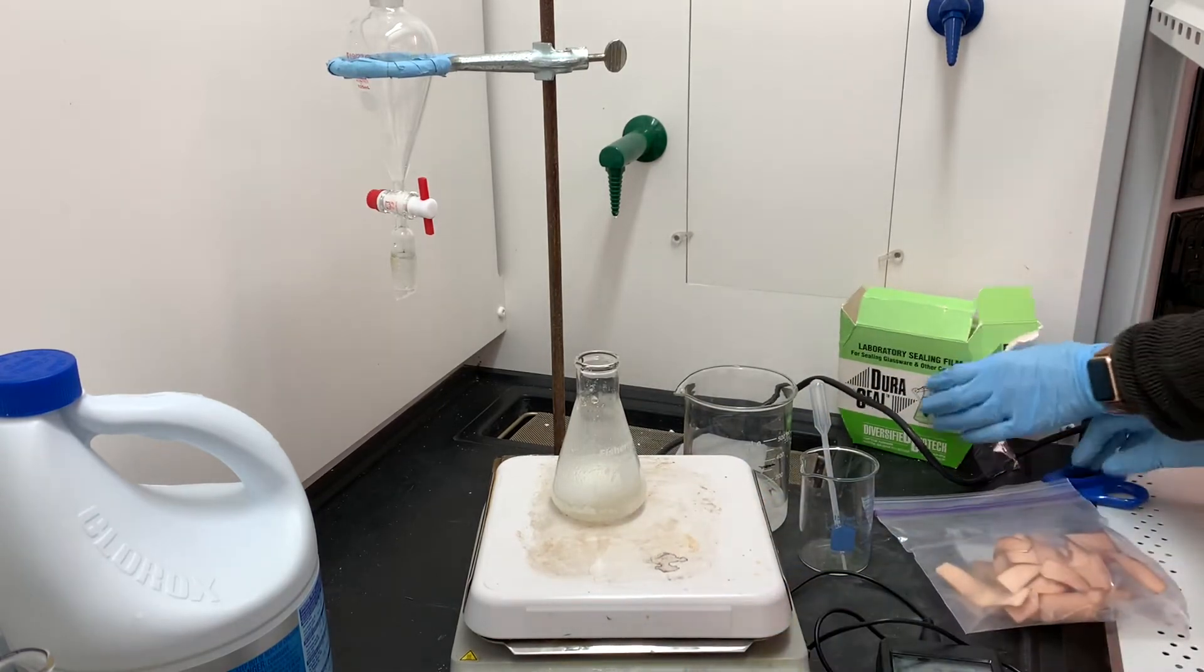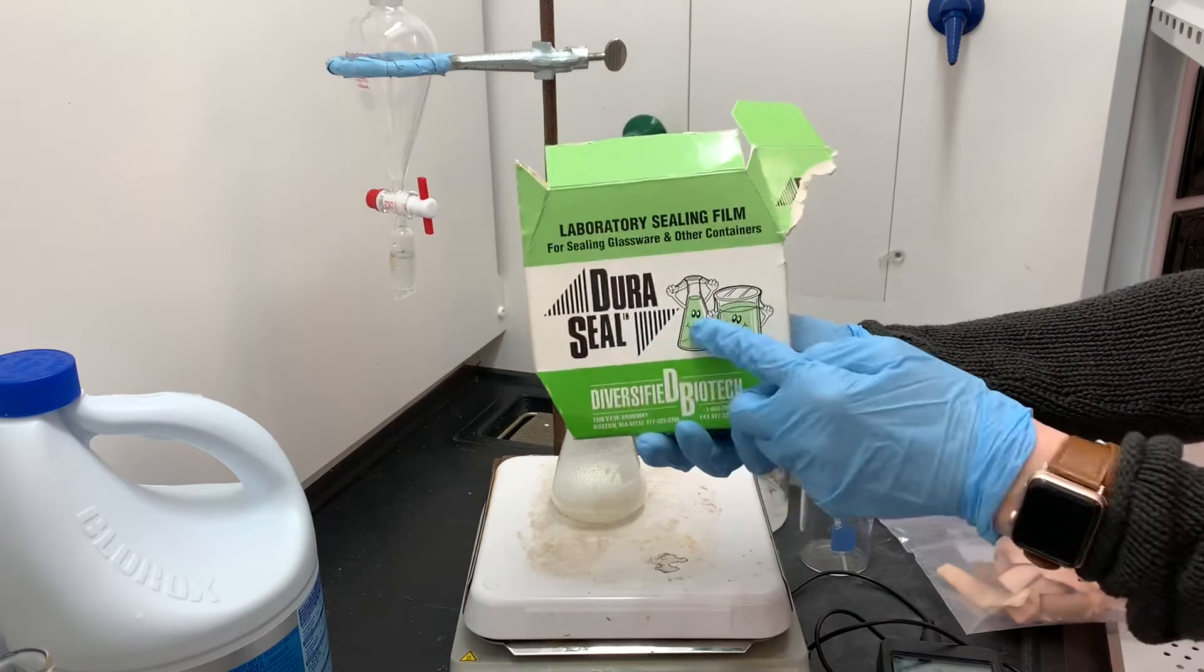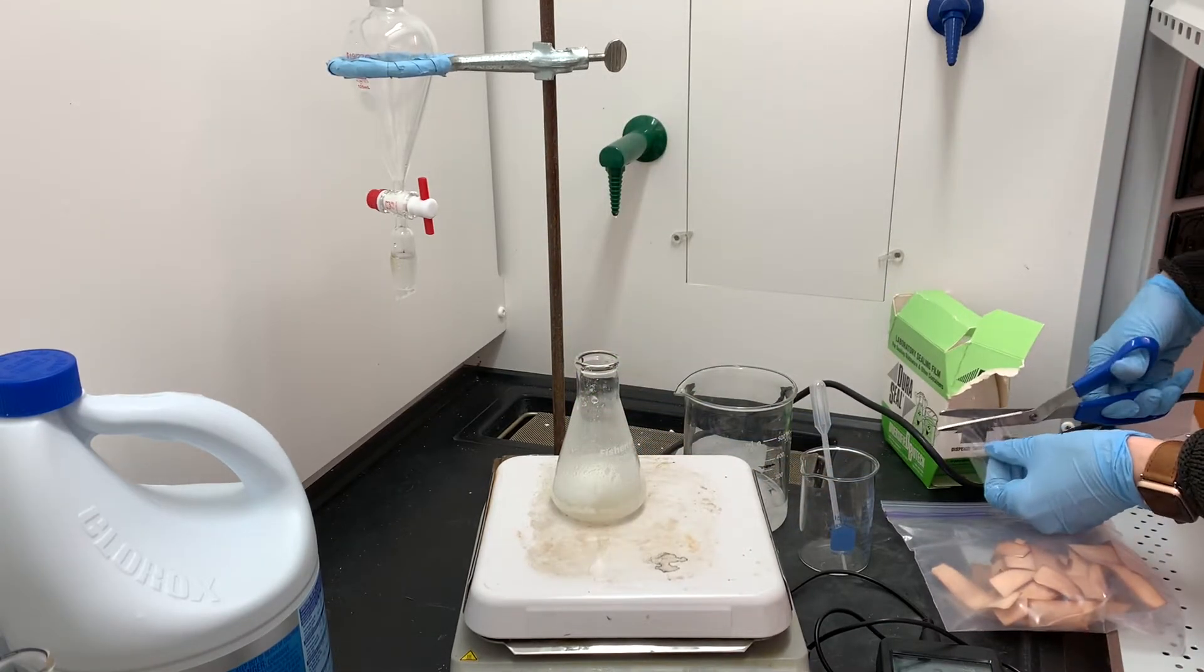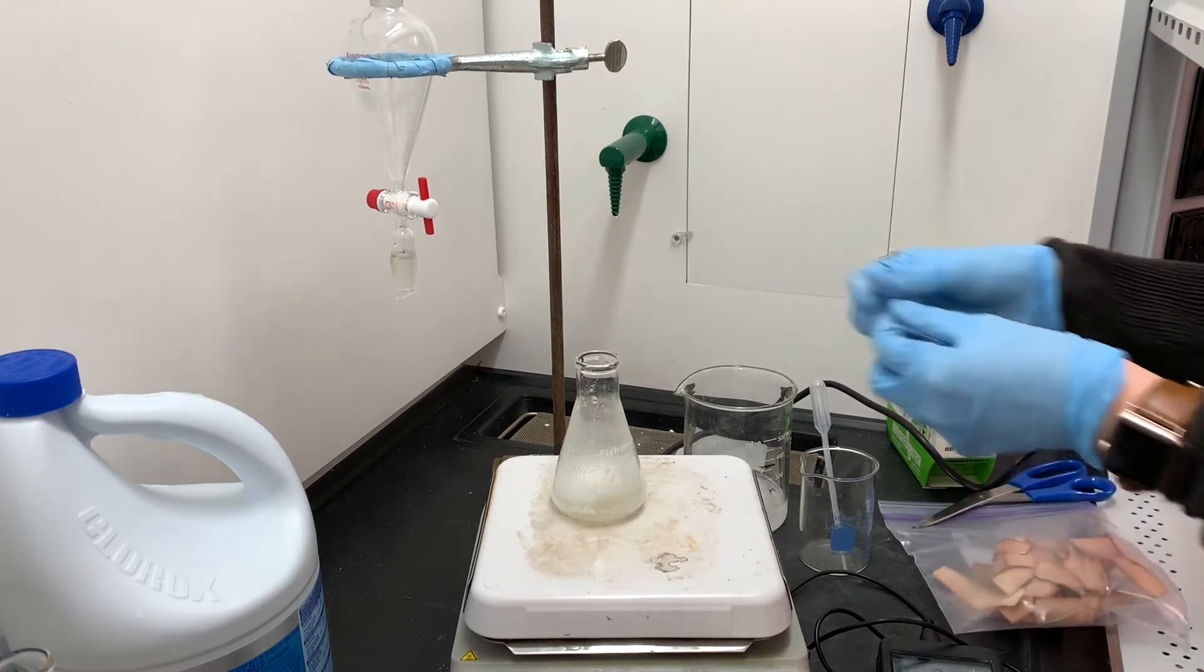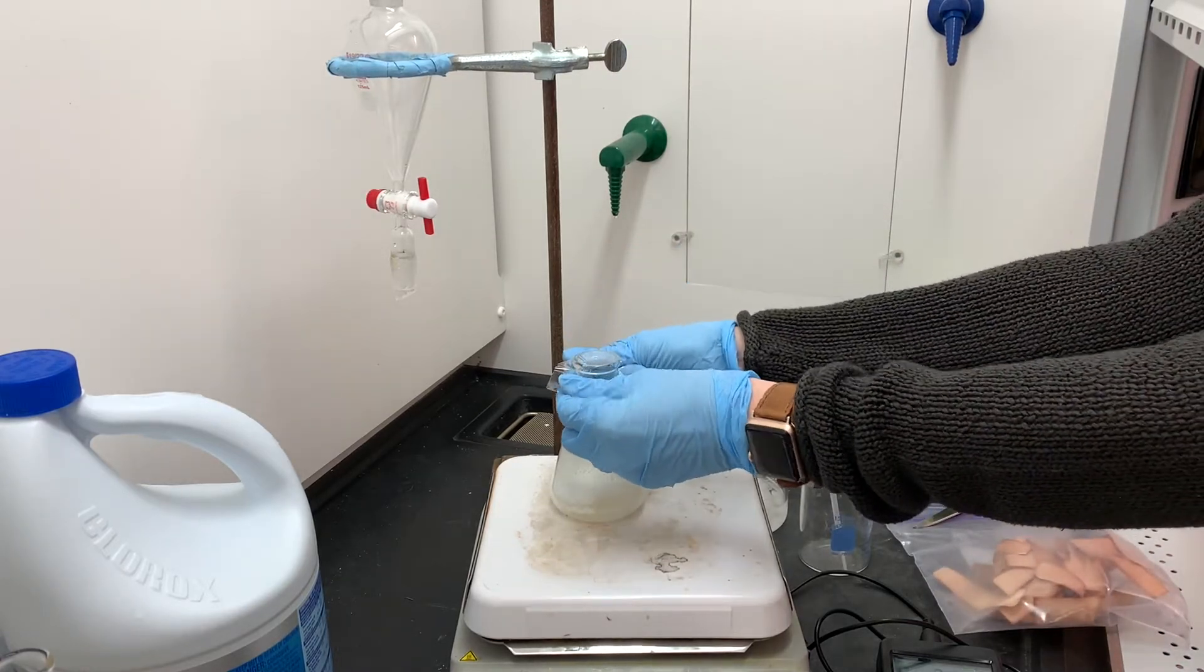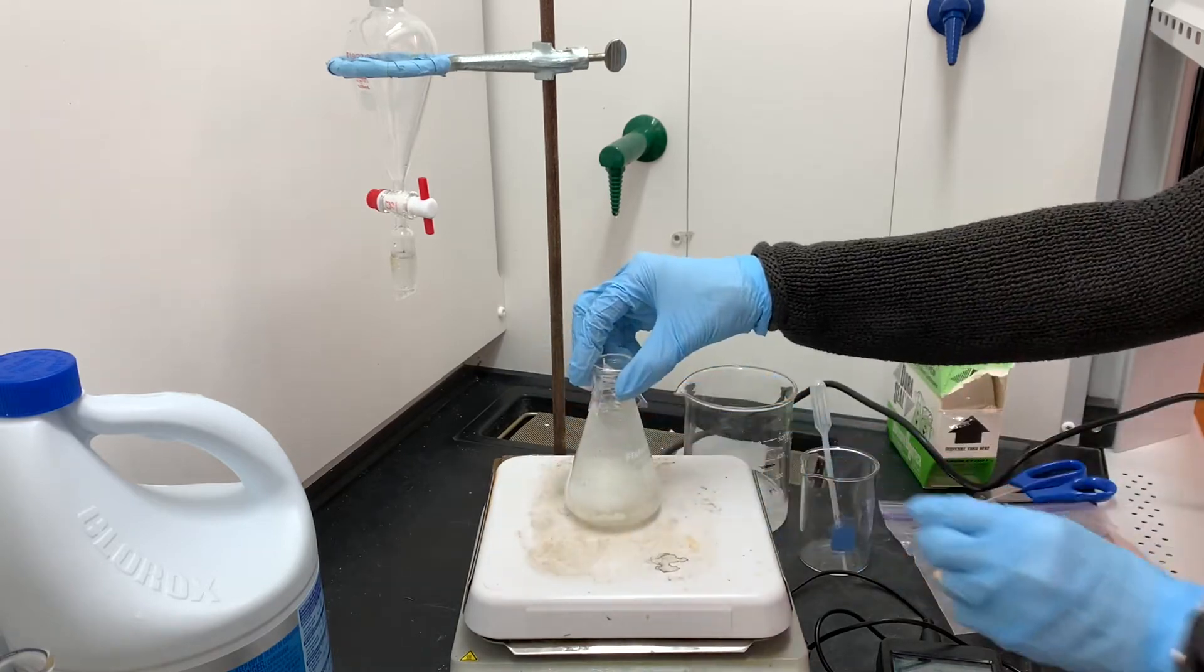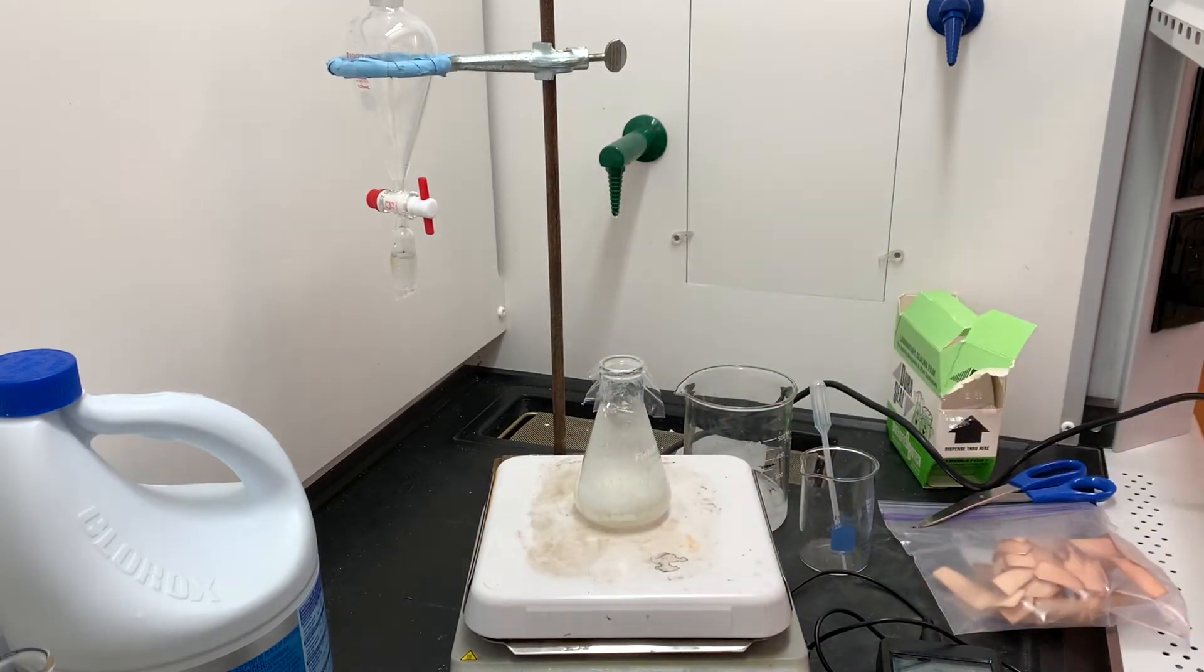So in order to keep this safe during the 30-minute reaction period, I'm going to be using some of this film to cover the top of the Erlenmeyer flask. And once I get it all sealed up, I'm just going to let it sit and stir for about 30 minutes and continue testing it with starch iodide paper about once every five minutes to make sure there's plenty of bleach.